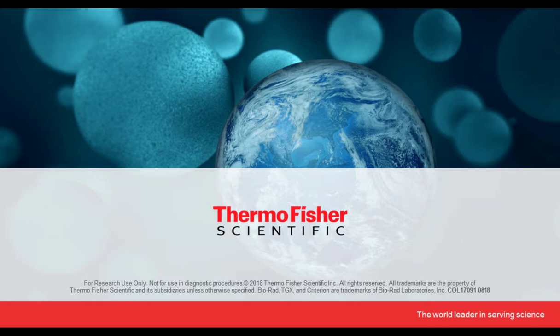Thank you. Next one is, sometimes I get a blue wave with my gel loading dye near the bottom of the gel. What causes that? It happens especially with precast gels. It does not happen that frequently, but it does happen occasionally. And the prominent reason for that is your sample buffer can get diluted for multiple reasons.